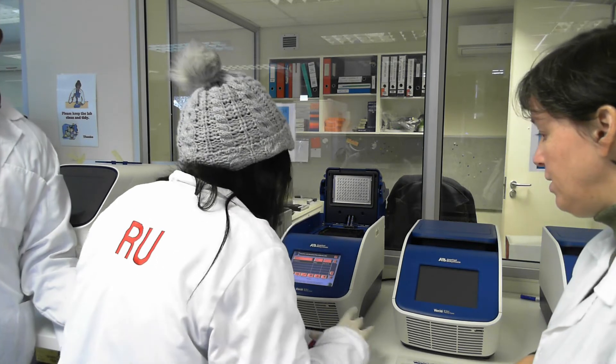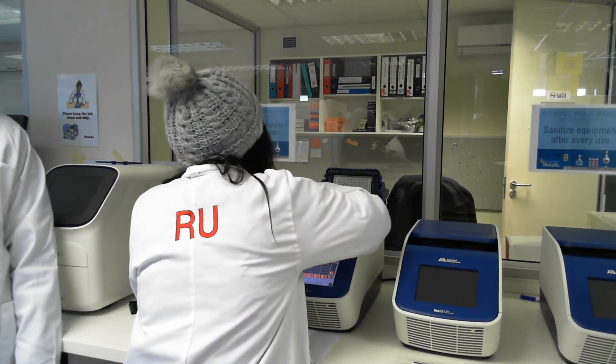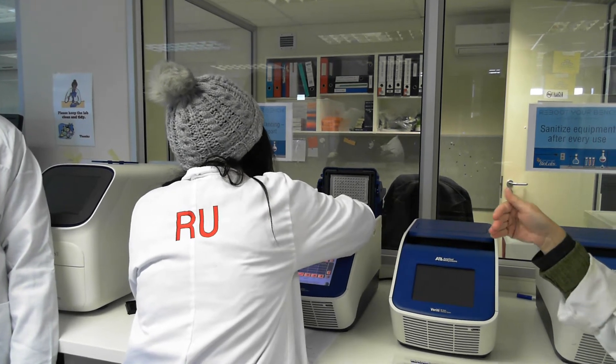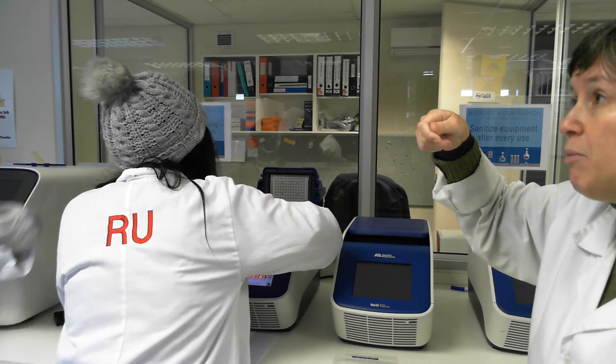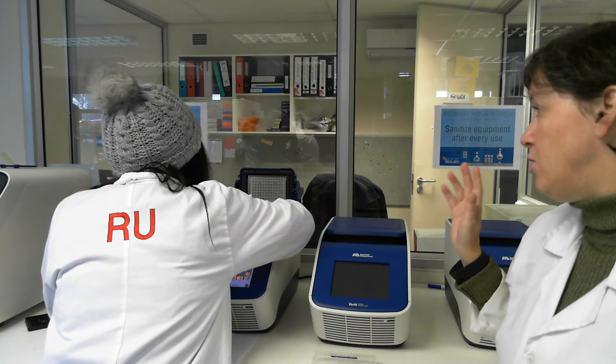So put everyone's tubes in. Doesn't matter which way. It's always a good idea to put your tubes in the order you've labelled them in, simply because sometimes the labels come off. Doesn't matter — it's up to you.